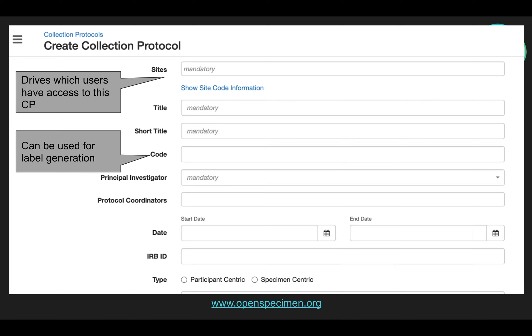The title is the long title of the collection protocol. The short title is basically the title which will be displayed over all the pages of the CP. The code is the unique identifier and can be used for label generation. The principal investigator and coordinators of the CP — please note that when you select a user as PI or coordinator, it doesn't mean the users will get the roles of PI and coordinators. You will have to manually assign them the roles. There is also a start date and end date of the CP.